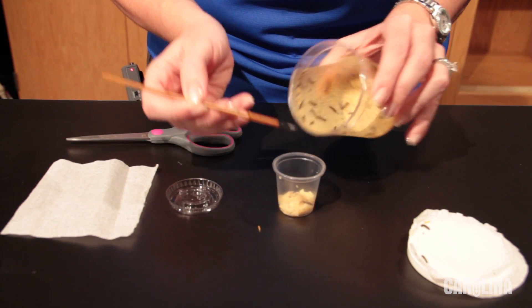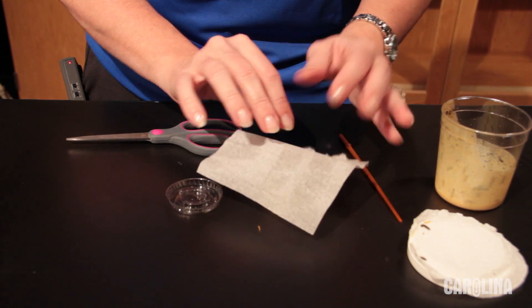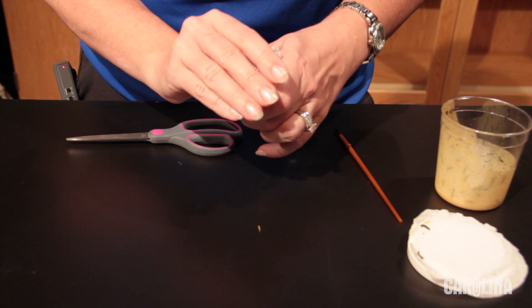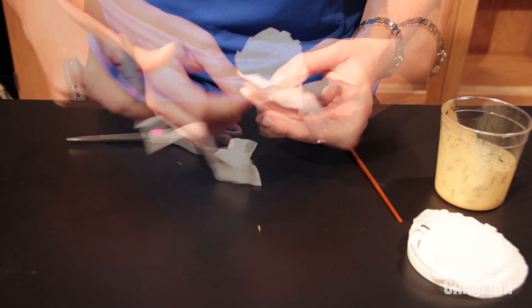Use a brush to transfer larvae — use the side of the brush to avoid injuring them. Place tissue over the opening of the cup and secure it with a lid. The lid has pre-punched holes for air. Trim away the excess tissue.